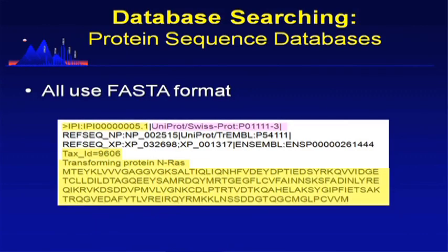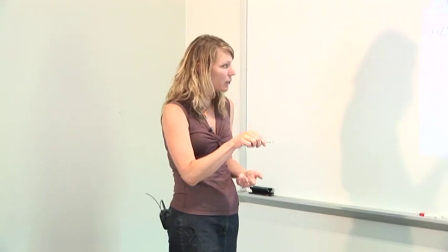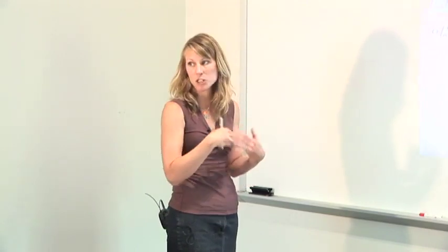So this is important to know if you want to create a custom database or a custom entry to your database. So oftentimes someone will come to us and they'll say, well, I have this protein, but I mutated it. So we go into the database and we go in here and we change one of the amino acids, or we just create a new entry.